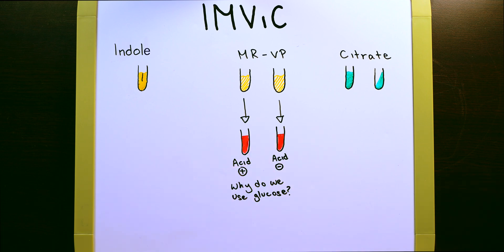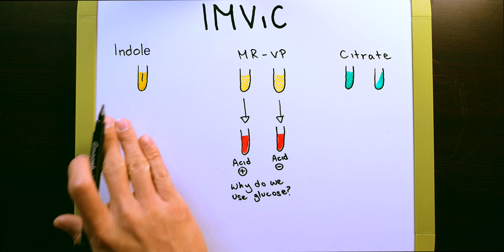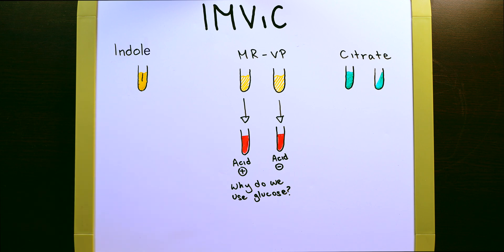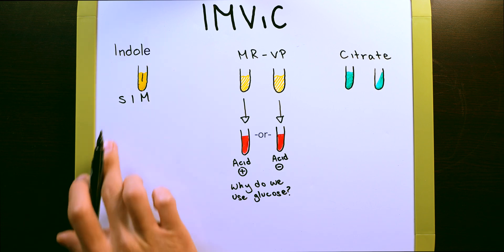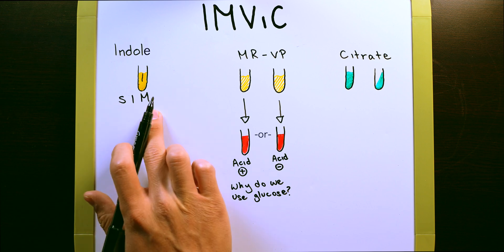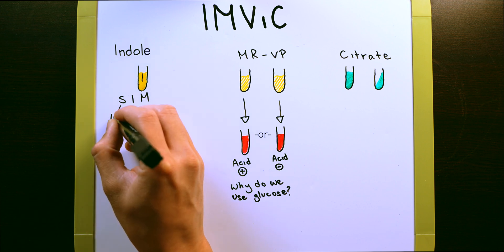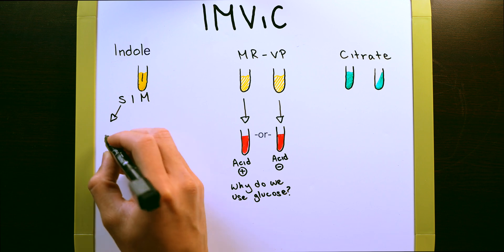As you're waiting for the results of your MR-VP test, you can go ahead and move over to indole. This is going to be the next most time consuming. The indole, what we actually do here is we're using a SIM test. And what SIM stands for is sulfur, indole, and motility. And we're actually going to be able to see all three results in this test tube.